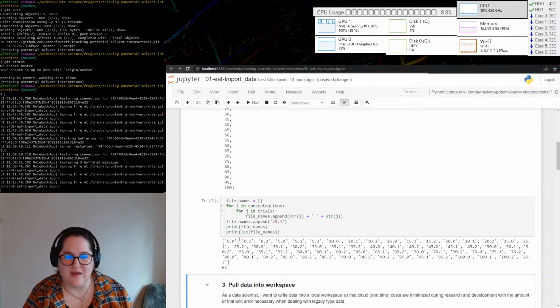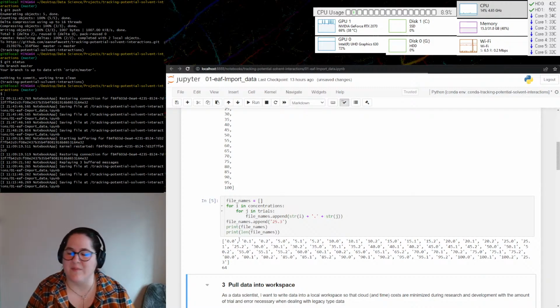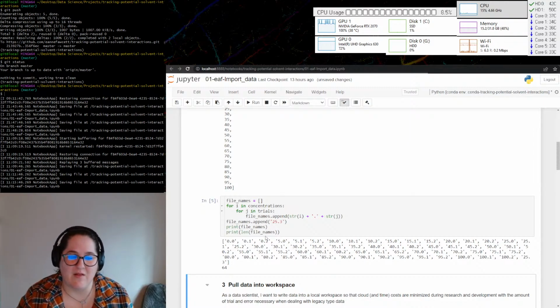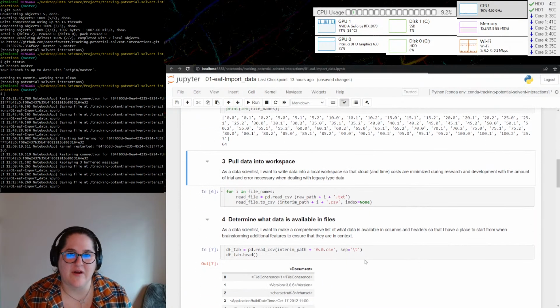I pre-mixed everything and refrigerated it before running all of this, but 7 minutes is not that long whenever you're in goggles, gloves, and you're having to swap out gloves in between and make sure that you have the right sample and all of your stuff that you need to flush the column if you need to. So you don't have really time to parse data while you're collecting information.